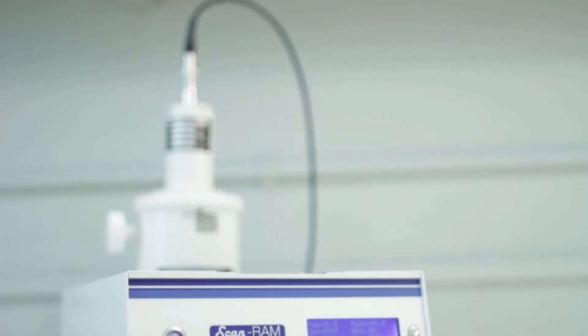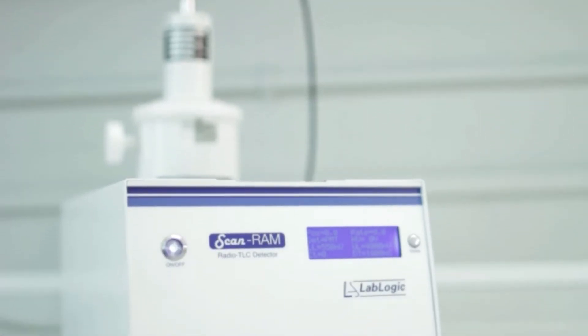Hi, I'm Scott Baker, one of the product specialists here at LabLogic. We're here to tell you about the ScanRam, our innovative, flexible and compliant radio TLC analyzer used in the radiopharmacy environment for radiochemical purity testing.